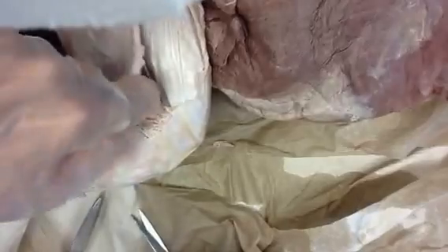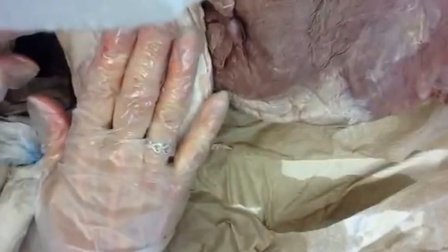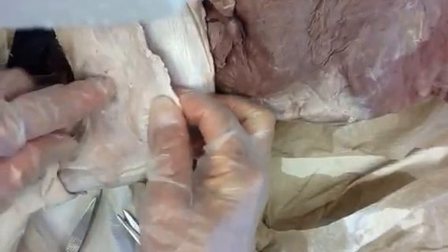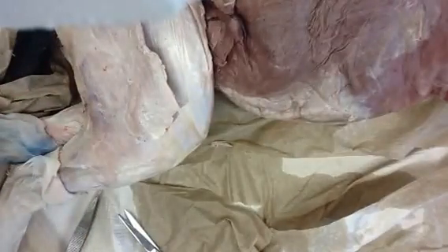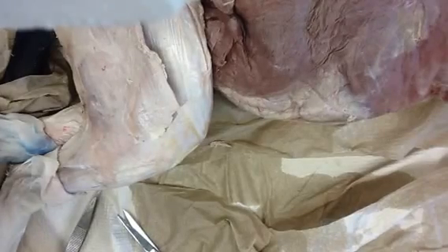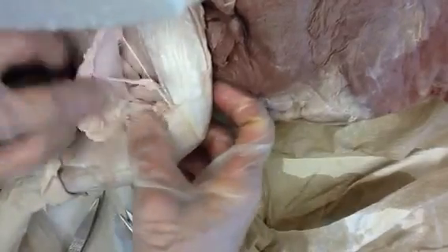Which hamstring muscle is this one — is this the lateral or the medial of the leg? Lateral. Okay, this is the lateral. And so which muscle is on the lateral side posterior? Posterior would be biceps femoris. That's right — biceps femoris. Good job.